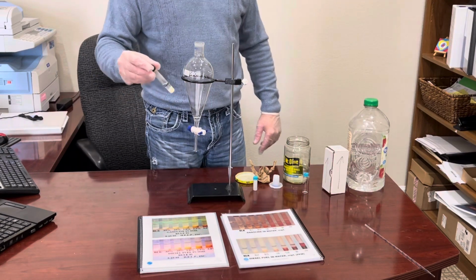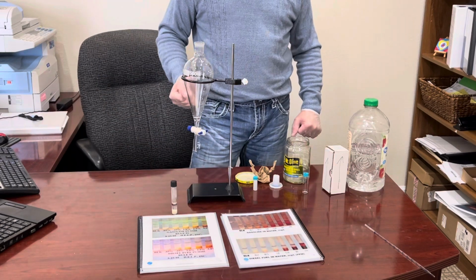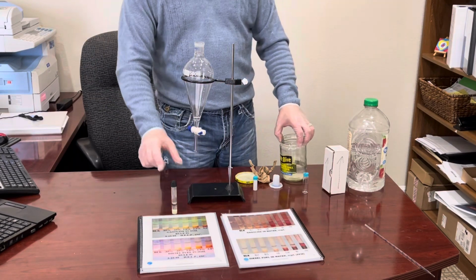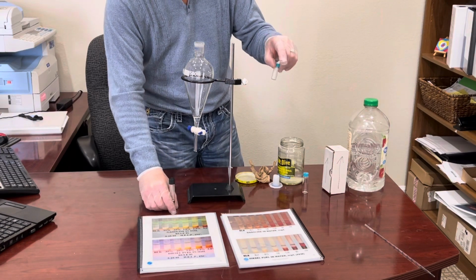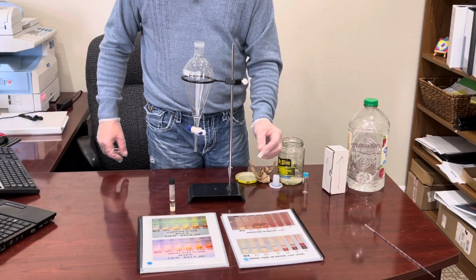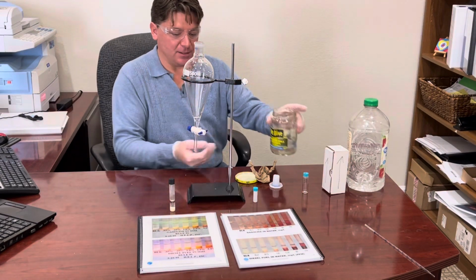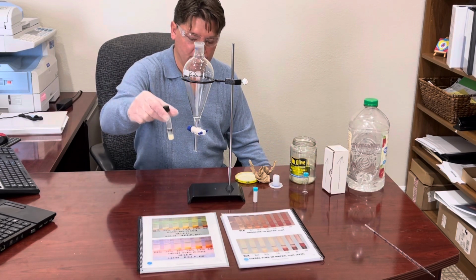So, as you can see, utilizing our high-range extract solvent will work for extracting from water. It's just we have to do that decanting step of our water sample to make sure that we don't get water into our test tube before we add our anhydrous or dry catalyst powder, because it reacts with water. It'll puff, smoke, and heat up, and that's not what we want. It'll hydrate our catalyst. So we want to make sure we get rid of that water sample prior to releasing the extract from that water into our test tube.